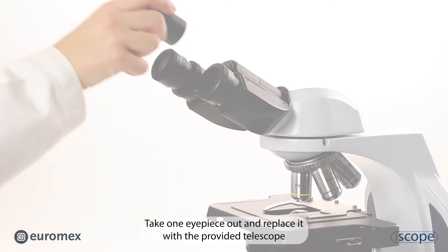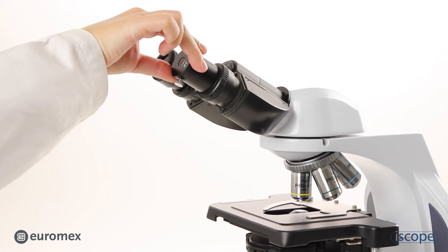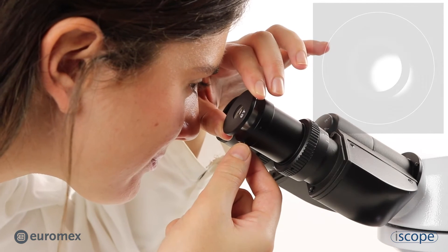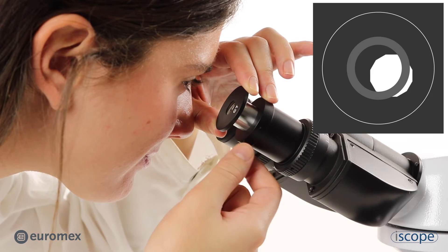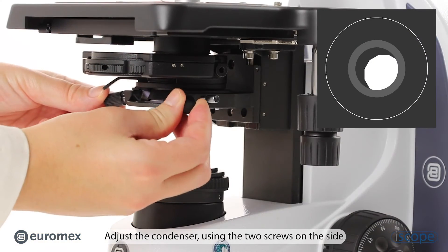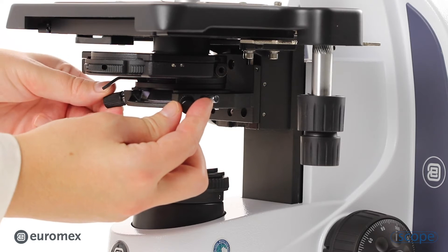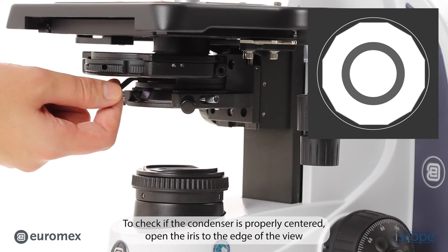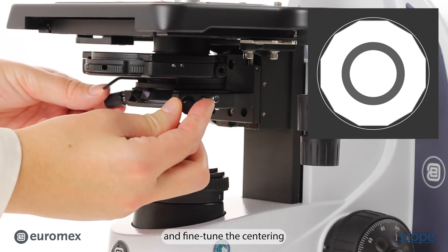Take one eyepiece out and replace it with the provided telescope. Focus the telescope on the iris of the condenser. Adjust the condenser using the two screws on the side. To check if the condenser is properly centered, open the iris to the edge of the view and fine-tune the centering.